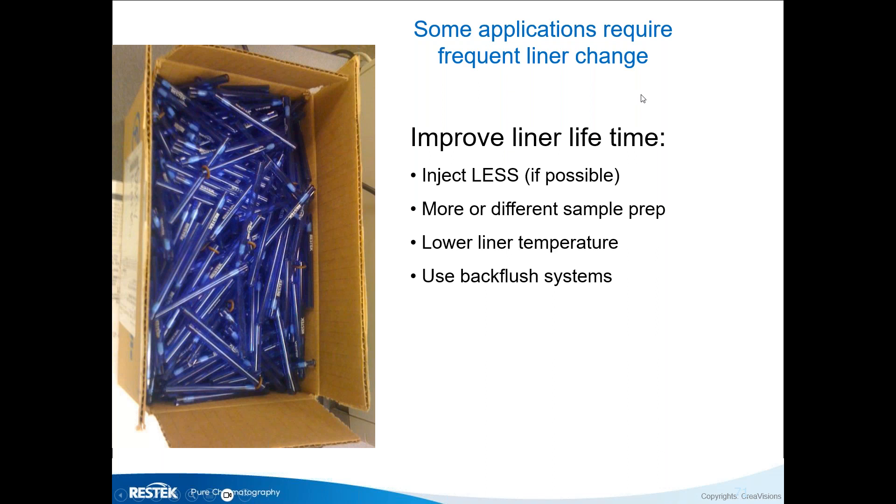To get more analysis out of your liner: inject smaller volumes if detection limits allow, invest in more sample cleanup, or lower the inlet temperature by 10–20 degrees — at a lower liner temperature the liner lasts longer. The best approach is to use a backflush system to clean the liner after each injection, though this is available only in limited configurations.